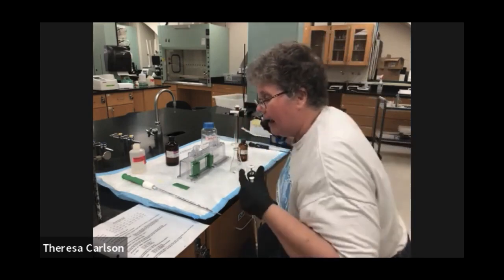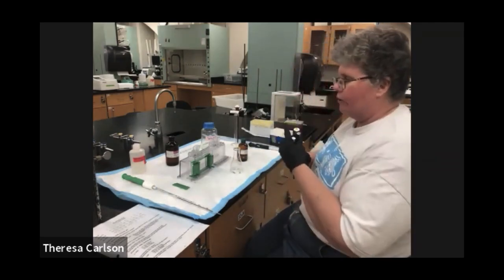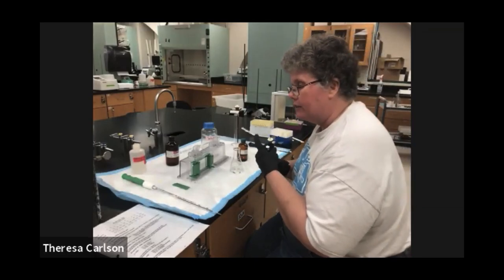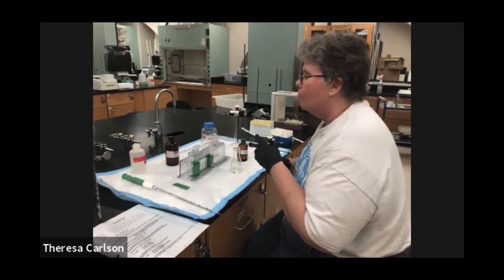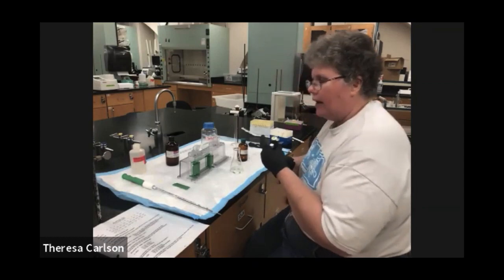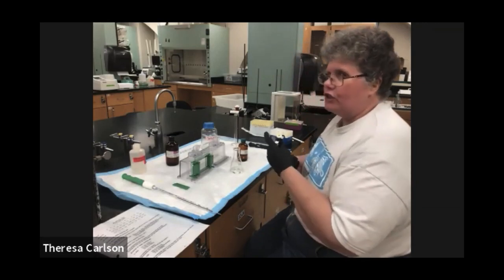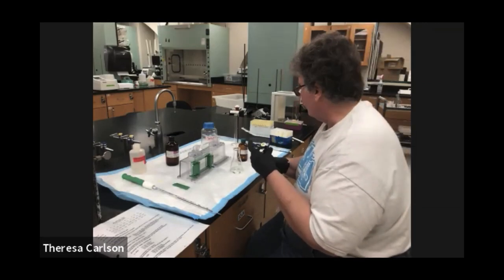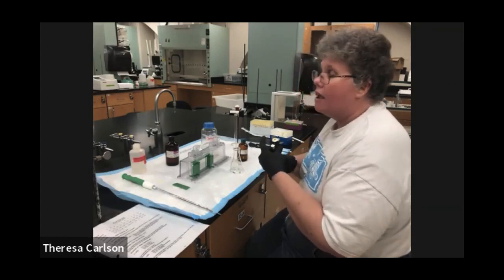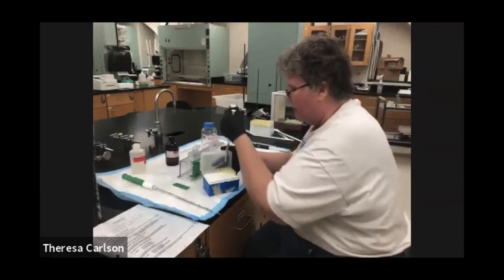Then we're going to add 10 microliters of TEMED theoretically, except we're going to add some extra TEMED here. So this is going to be a change in protocol. Instead of 10 microliters of TEMED, we're going to add 20 microliters of TEMED to make it polymerize a little faster. It will polymerize eventually, even with 10 microliters of TEMED, but it's just a long, long time for it to polymerize. So having added a little bit extra TEMED means it polymerizes in 15 minutes, for example, instead of 30 minutes.